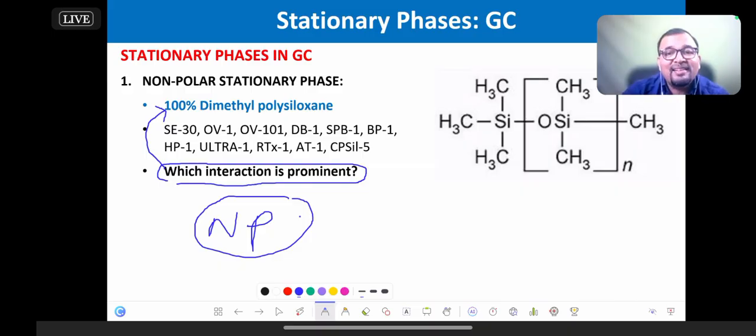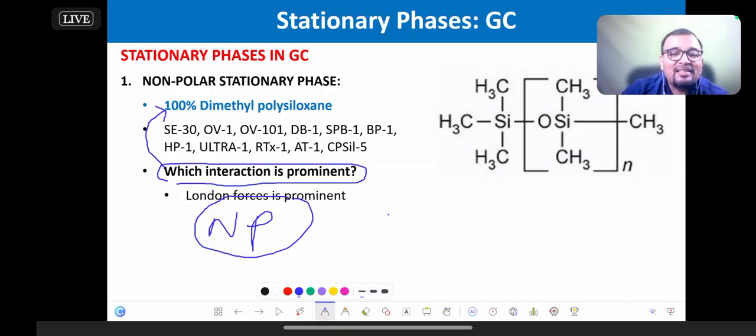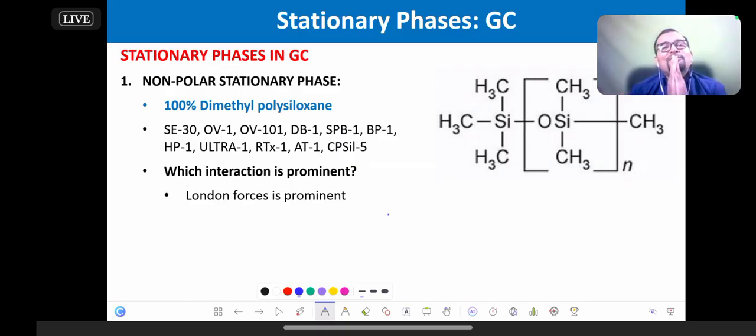Dilip, you are right. Fantastic. Some of you are giving the right answer. I'm happy. Valmik, you are right. Deepak, you are right. Awesome. Rashmita, you are also right. Chandana, you are right. Gajanan, you are right. It is none other than the London Dispersion Force, or LDF. So please type in LDF in the comment box. This was the first retention mechanism we learned today. London Dispersion Force.